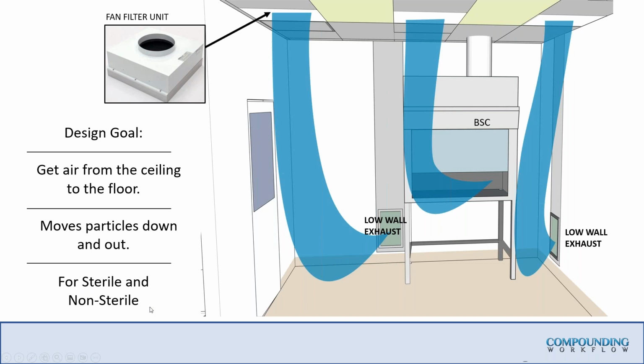It's not called out in Table 2 in USP 800, and I get that, but the reality is if I'm handling powder, I'm doing capsules, I'm doing troches, I'm doing creams, I'm doing anything that requires me to handle a dry API, and my technicians, bless their hearts, keep pulling their hands out of that powder hood to go retrieve another weigh boat or another tamper for the capsule plates or whatever it is. When they aerosolize that micron-sized powder, I want that airflow to essentially push it all the way down to the floor, because in a non-sterile environment, referencing 795, I've got to clean that floor every single day.